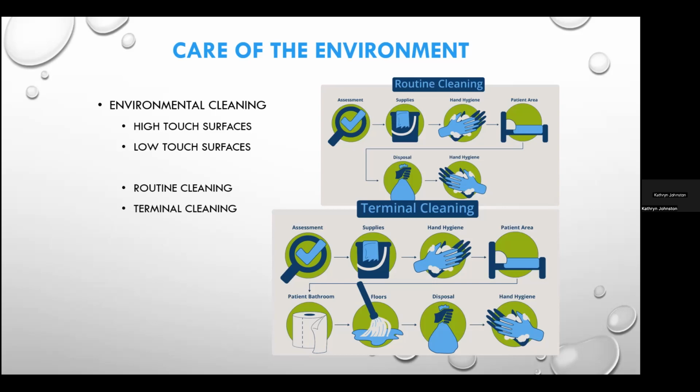So at a minimum, the laboratory should be cleaned at least once a day, but more often if visible contamination is seen. Usually routine cleaning in the patient wards occurs when a patient occupies a bed in a room, and terminal cleaning occurs when the patient's discharged or transferred out of the room.